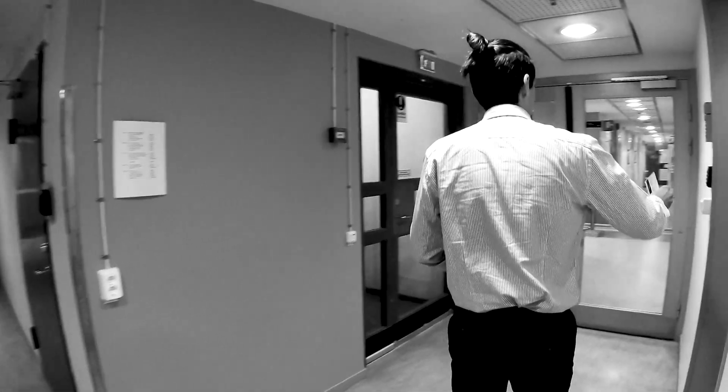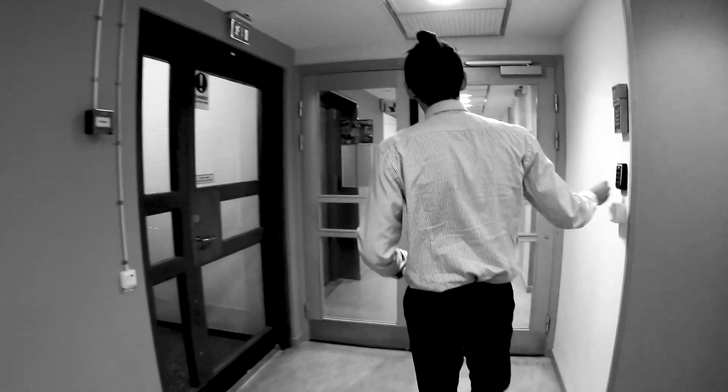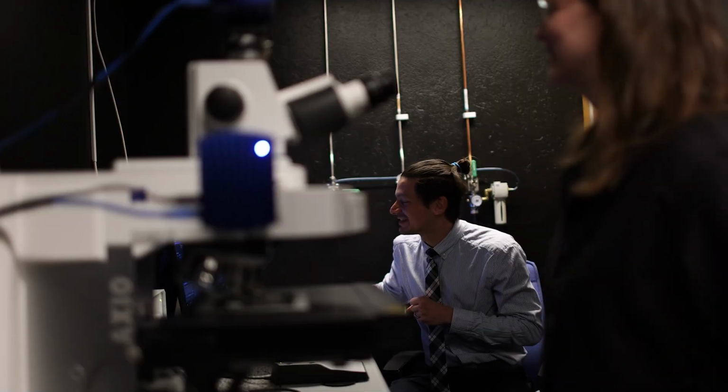What exactly is array tomography? So array tomography stands for a technique in which, imagine that you have a sample, usually a volume, if you think about it. So basically like a piece of tissue, right? And you want to be able to reconstruct a 3D view of that tissue. The issue is that there are a lot of techniques that cannot penetrate from the surface. So if you try, you will only get an image of the surface.